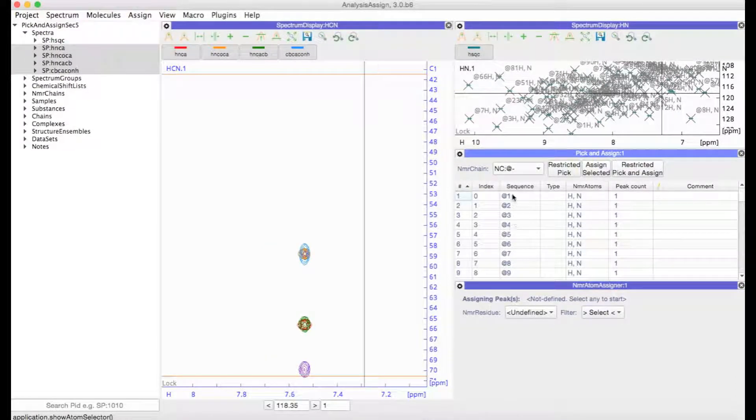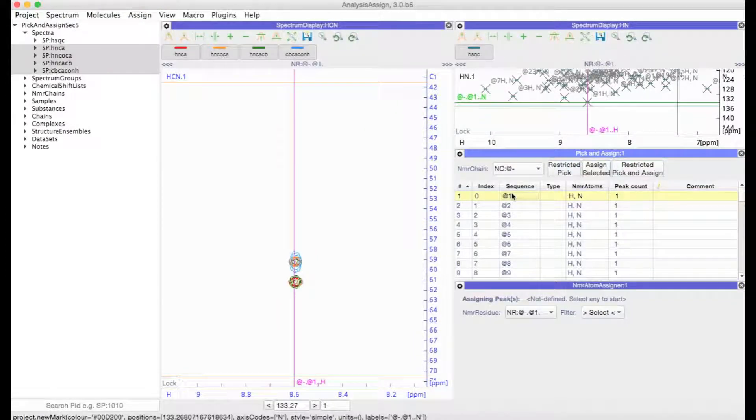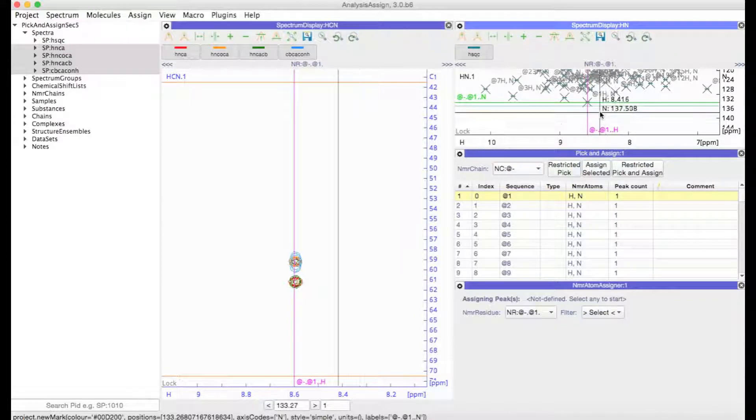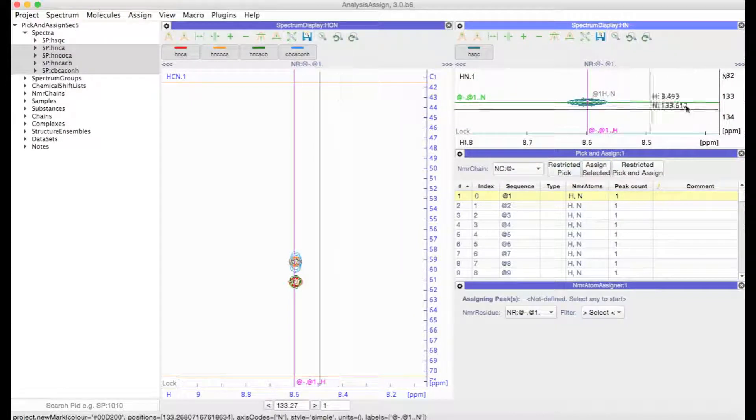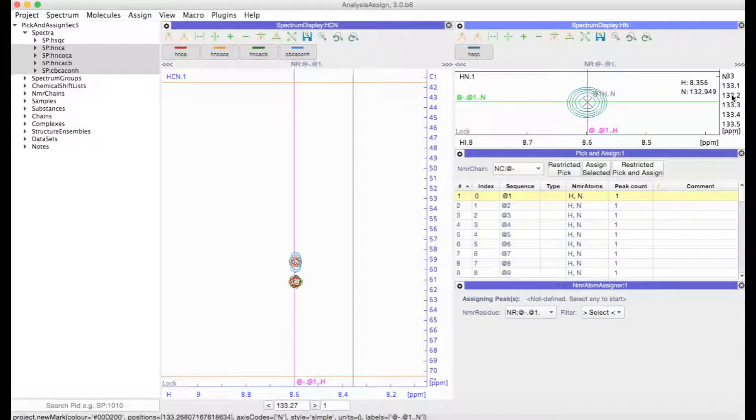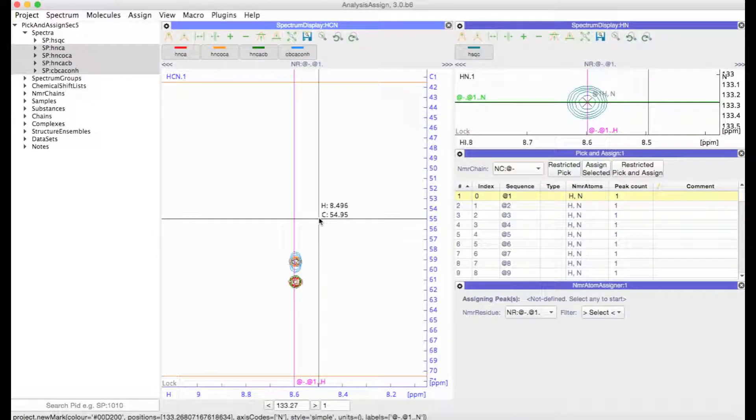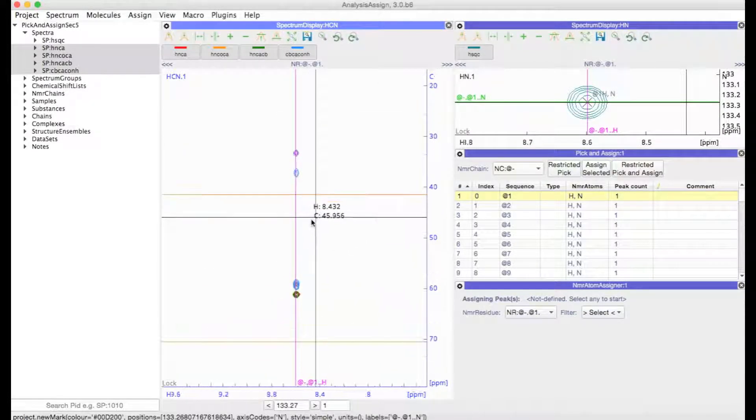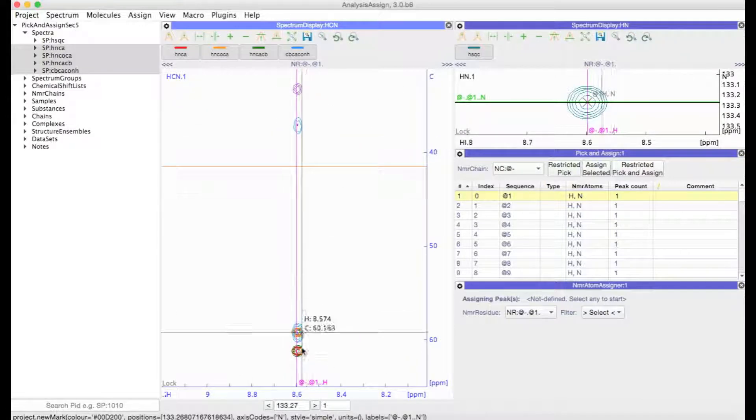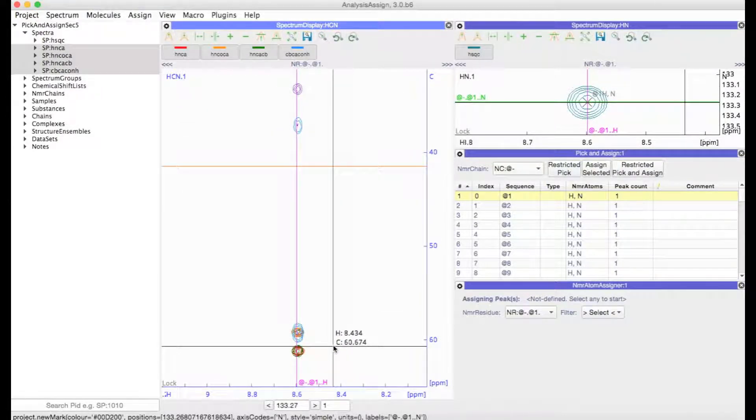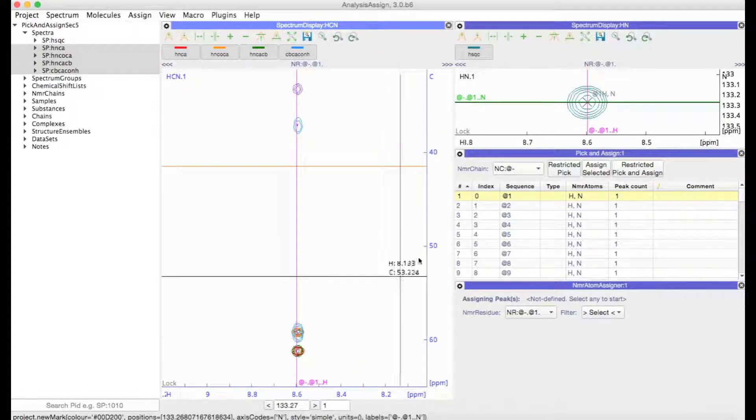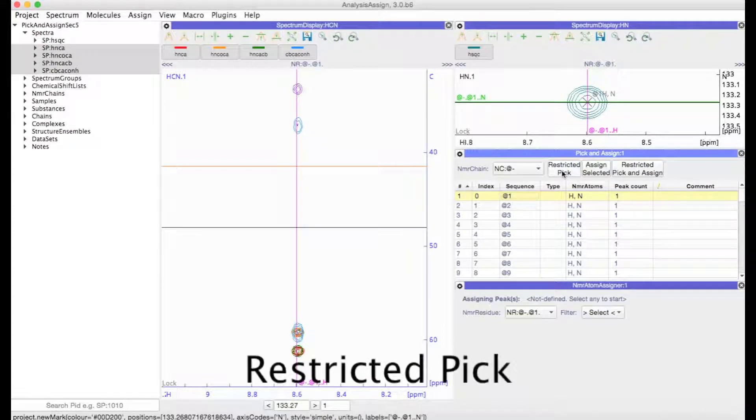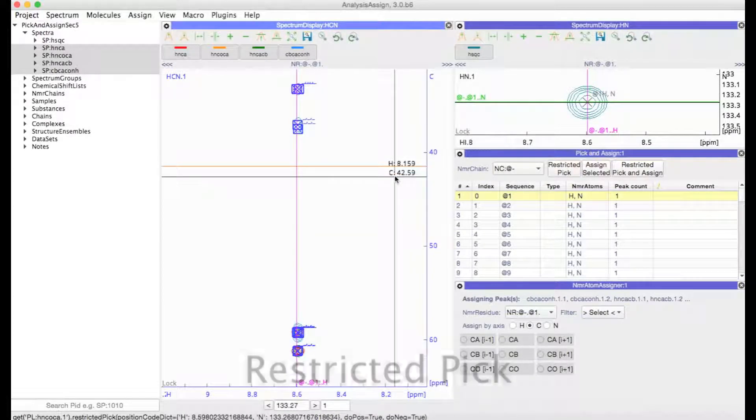So now we're ready to start, and we can do that simply by going to our Pick and Assign NMR residue table and double clicking on the first one. You can see that the displays have automatically navigated to the peaks belonging to that NMR residue or to those positions. These now are our 3D peaks and we can pick them using this restricted pick button.